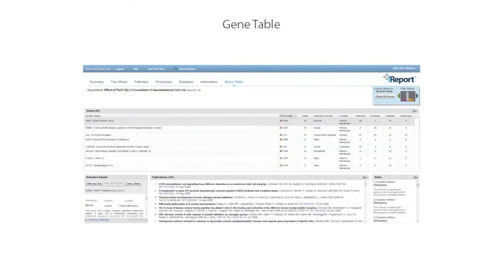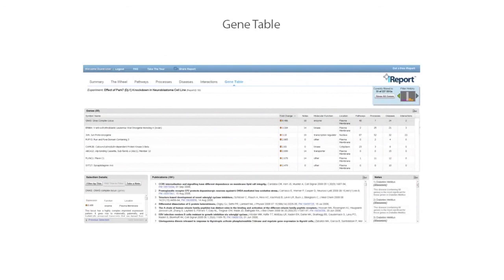The gene table contains a simple, sortable table of all your differentially expressed genes, their expression data, basic annotations, and a tally of all pathways, processes, diseases, and interactions they are involved in. Additionally, you can see which genes you've taken notes about. You can export your gene table, your notes, gene lists, and many other items throughout iReport.